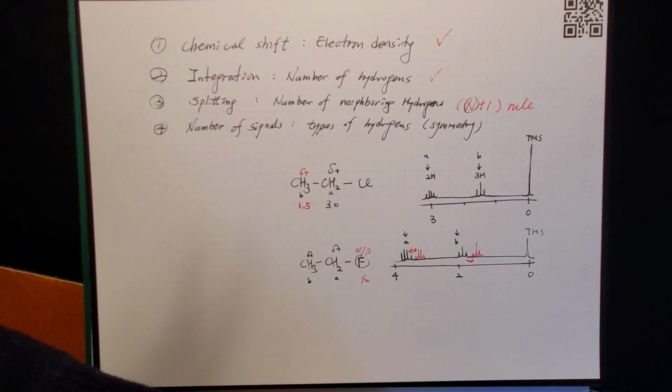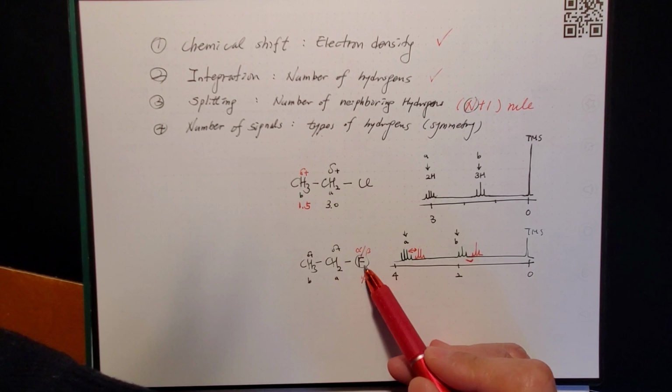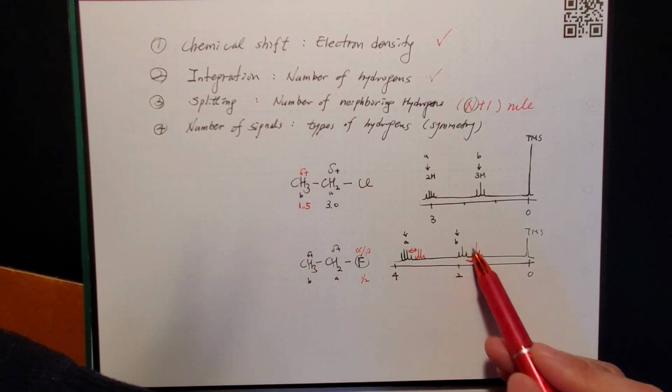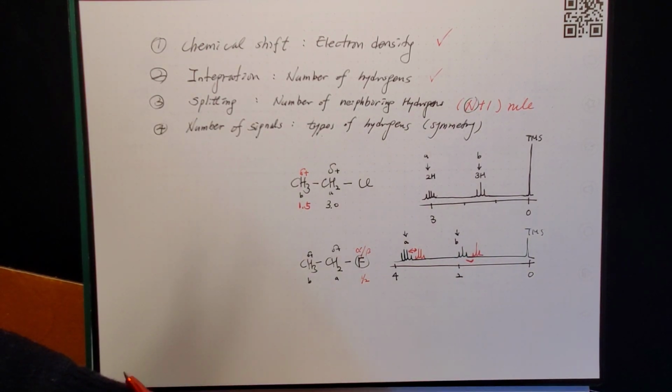Okay, even between halogens, fluorine influences the alpha very much and de-shields them very much, but fluorine does not influence the beta as much. So the 50% rule for the beta hydrogen doesn't really apply well for the fluorine.